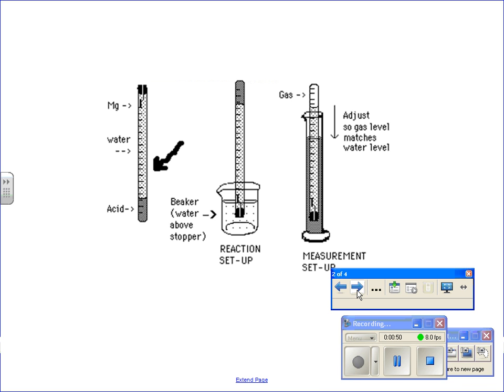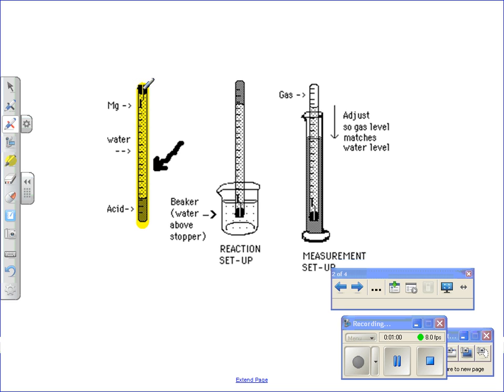What we're going to do during this lab is fill the gas collecting tube, which looks like a giant long test tube, like this right here. And we're going to do a couple key things. You're going to put a certain amount of acid. You need to know exactly how much acid. It's going to be 6 molar acid that you're going to use a graduated cylinder to measure. Then you're going to fill the rest of the gigantic tube with water.